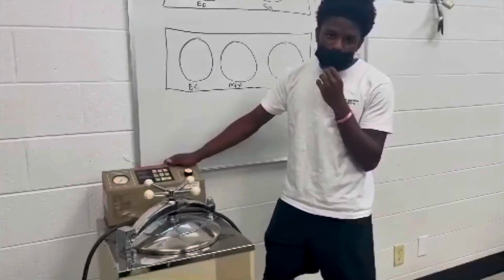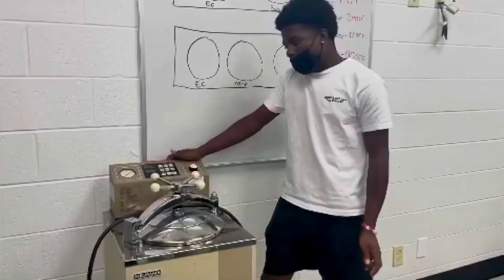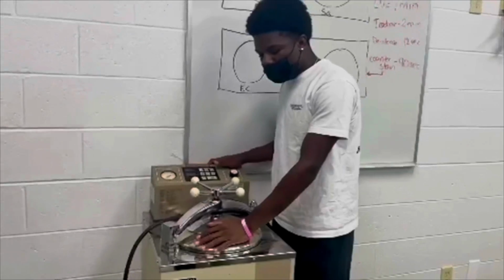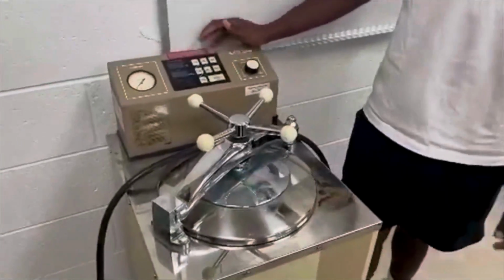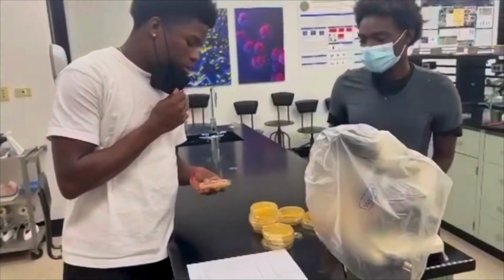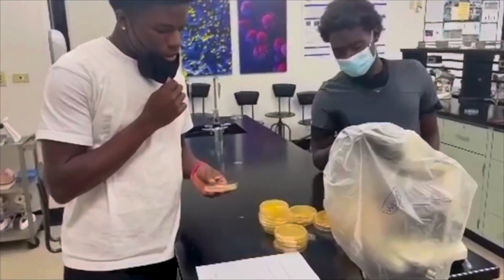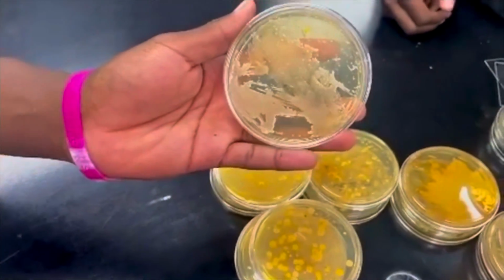There are many different types. We usually use tryptic soy agar. And in order for agar to be made, it is placed in here for a period of time. It is heated up, and we take it and pour it into petri dishes. Here we actually have some. A week ago in Oakwood Live, we had some students come from the high school, and they swabbed their phones, and as you can see, they're good.